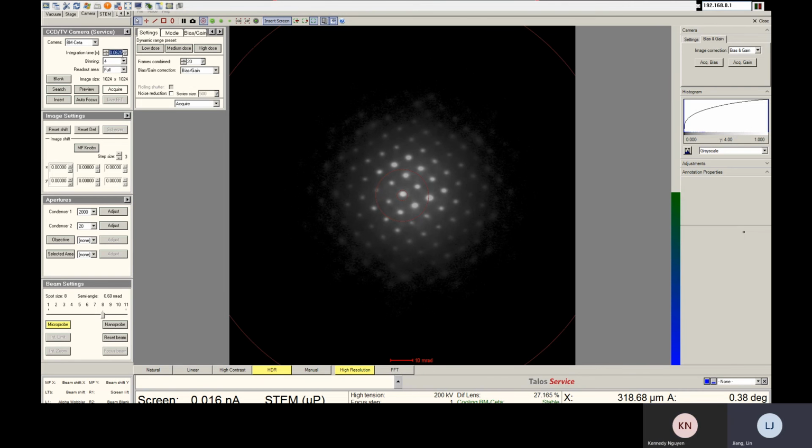The time acquisition is going to depend on this. If it's just this 20 frames, it's going to be 50. It's going to be 1 second, right? Am I right? For search, it's going to be 0.1. Let's see how it looks like, and then we can set up the application, right?